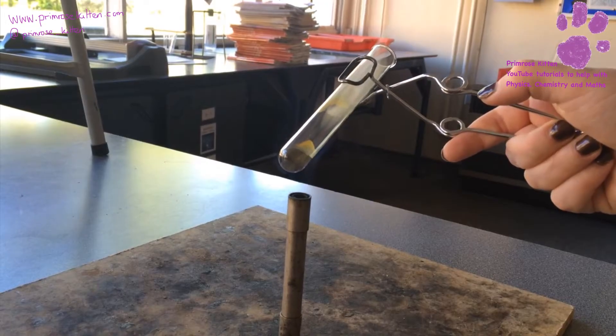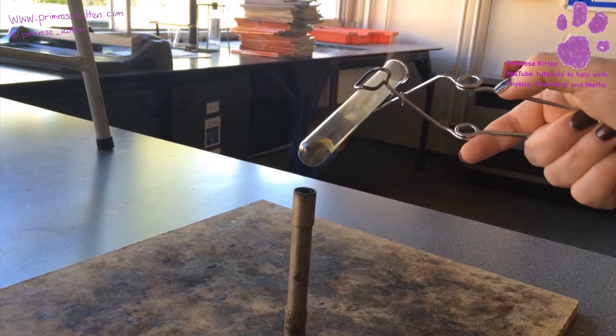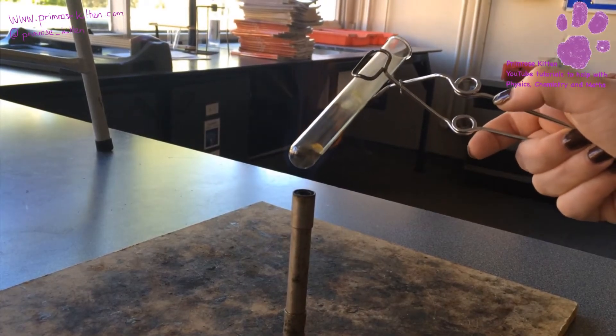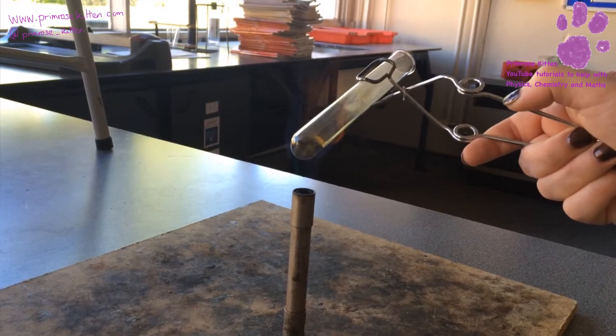Oh, a little pop of gas there. Heating this quite strongly, and hopefully soon we will start to see it changing color. There is quite a lot in there. We can start to see it going black already.